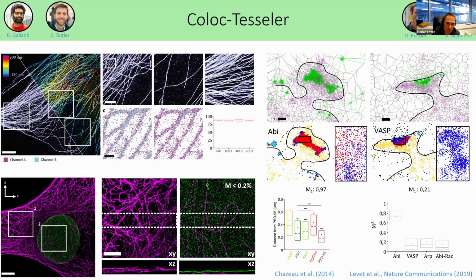And then in the second dataset, we randomly removed some localizations, from 100% of the localization density to 10%. And here you can see that when we computed the Manders coefficient on this dataset, we had something very, very stable, even when we removed localizations.